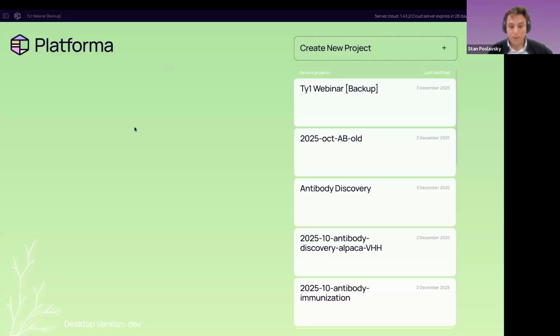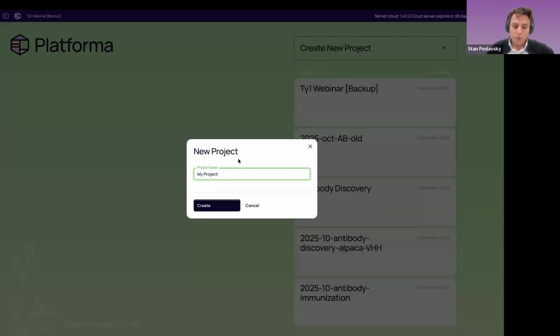Let's start going step by step and aim to get this result and find our TY1 nanobody as well as our other cousins of this nanobody from this data. So I'm starting with creating a new project. Let's call it webinar. Oops, webinar live.